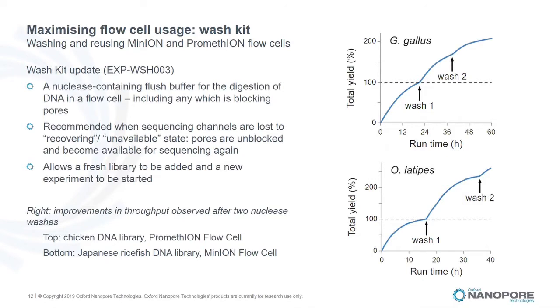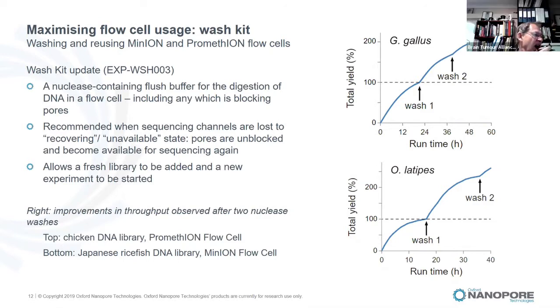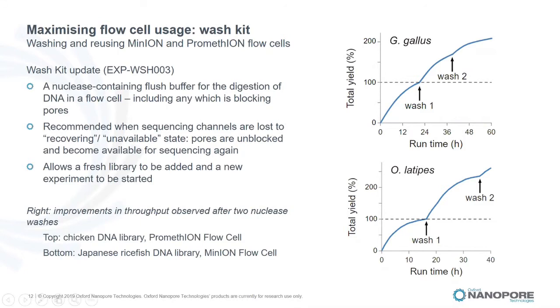Another really good point of nanopore is the real-time base calling, real-time sequencing. Real-time sequencing is not only useful for infectious disease, like rapid diagnosis. With real-time sequencing, you can monitor your sequencing in real time. If something is wrong, or if you think, oh, I want more throughput, you can actually wash in the middle of the run and apply more sample there.